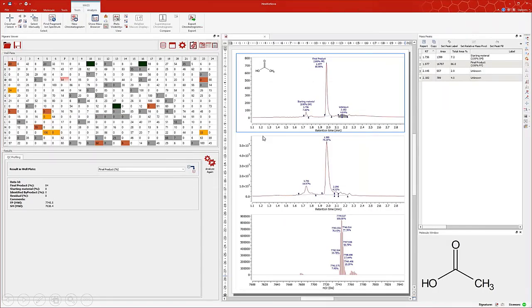So once you're happy with the settings, you select the output directory and press on process. Then after about 15 minutes to 1 hour of processing, depending on the number of samples you have, as well as their complexity, and of course the speed of your network plays also a crucial role here. We come to the point I've just shown you a few slides ago, which is this one.